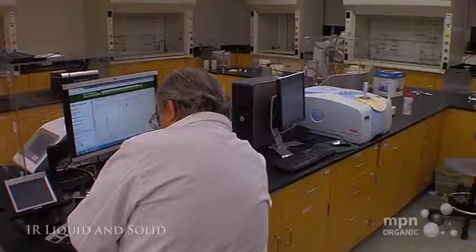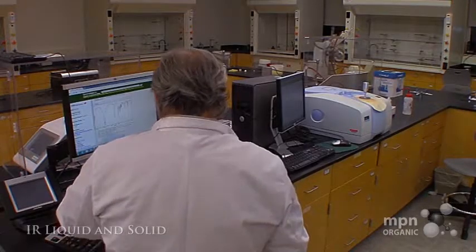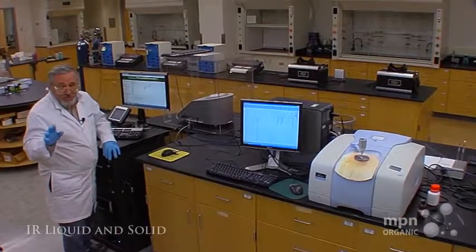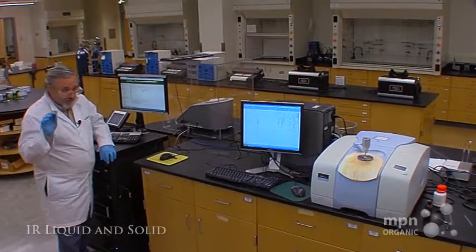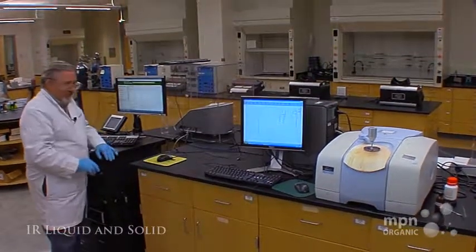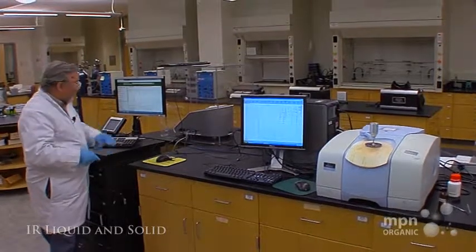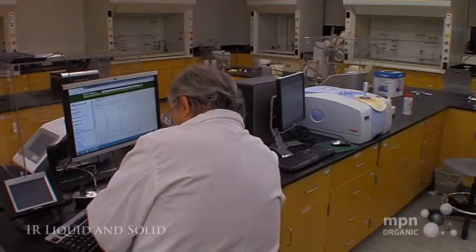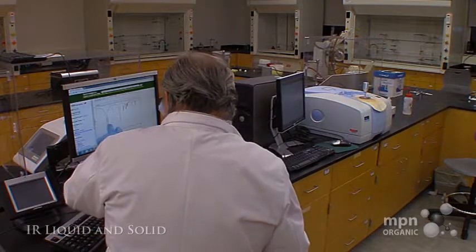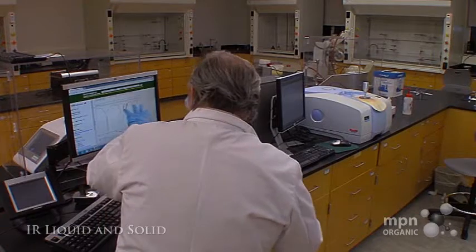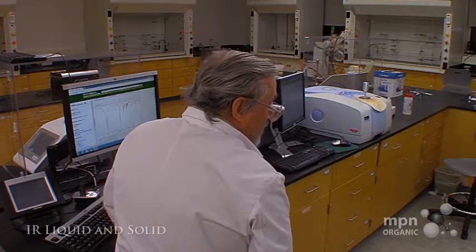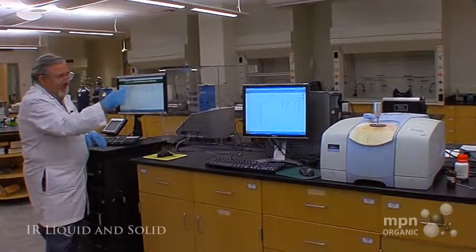So KBR was the one that came up and you'll see the similarities between what we have on the screen and what we have on the screen over there. Now if you click Nujol-Mull that's going to give you something a little bit different. That's a really old way of taking infrared spectra of solids. We don't have to do that type of thing anymore. And of course we haven't taken our infrared spectrum in carbon tetrachloride so that's really not an option. So we're going to go back to KBR disk and this now should be a very close match to what we have on the screen over there. So that's the KBR setting that we want.